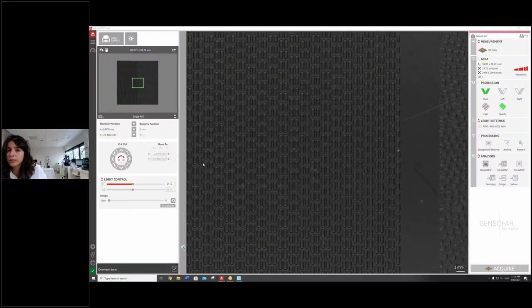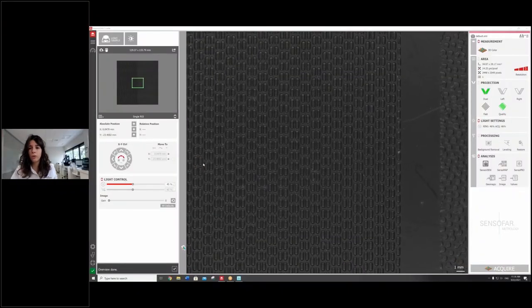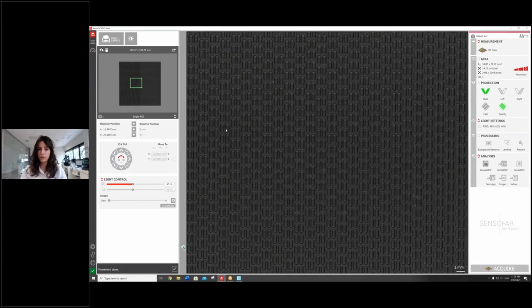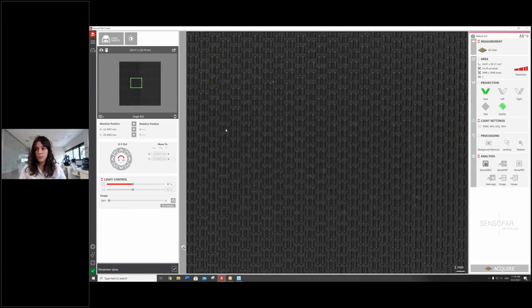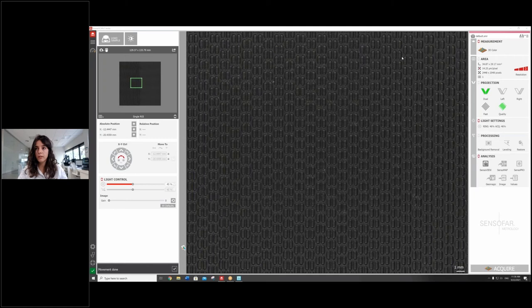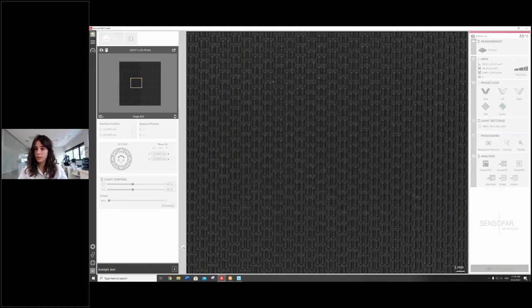And actually it is still in focus because the depth of focus of DS White is up to 40 millimeters. So both samples, even though the dimensions are pretty different, are going to be in focus. So in this specific case, we're going to click auto light as well. Same procedure.